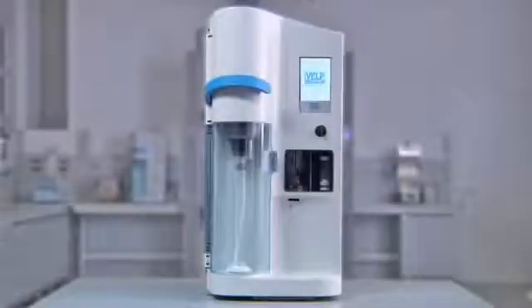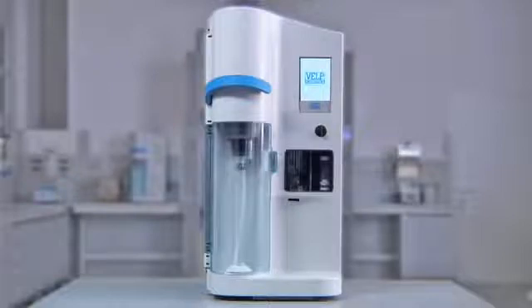The UDK 159, the ultimate complete solution for precise and reproducible determination when carrying out Kjeldahl analysis.